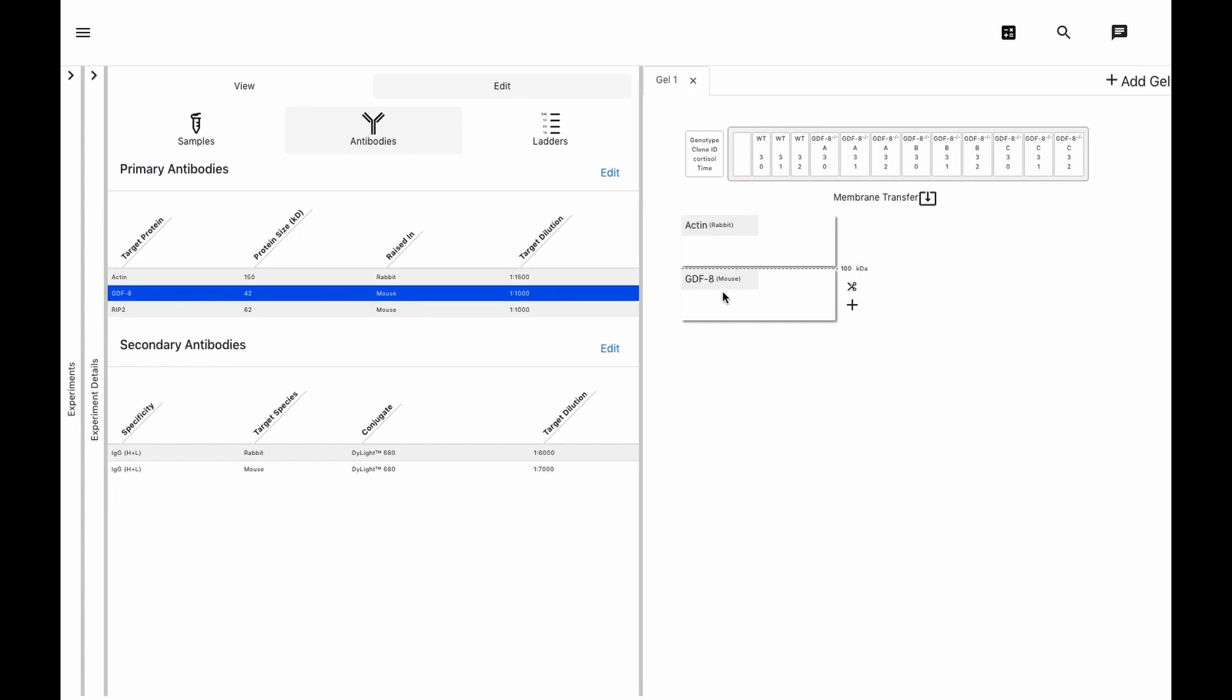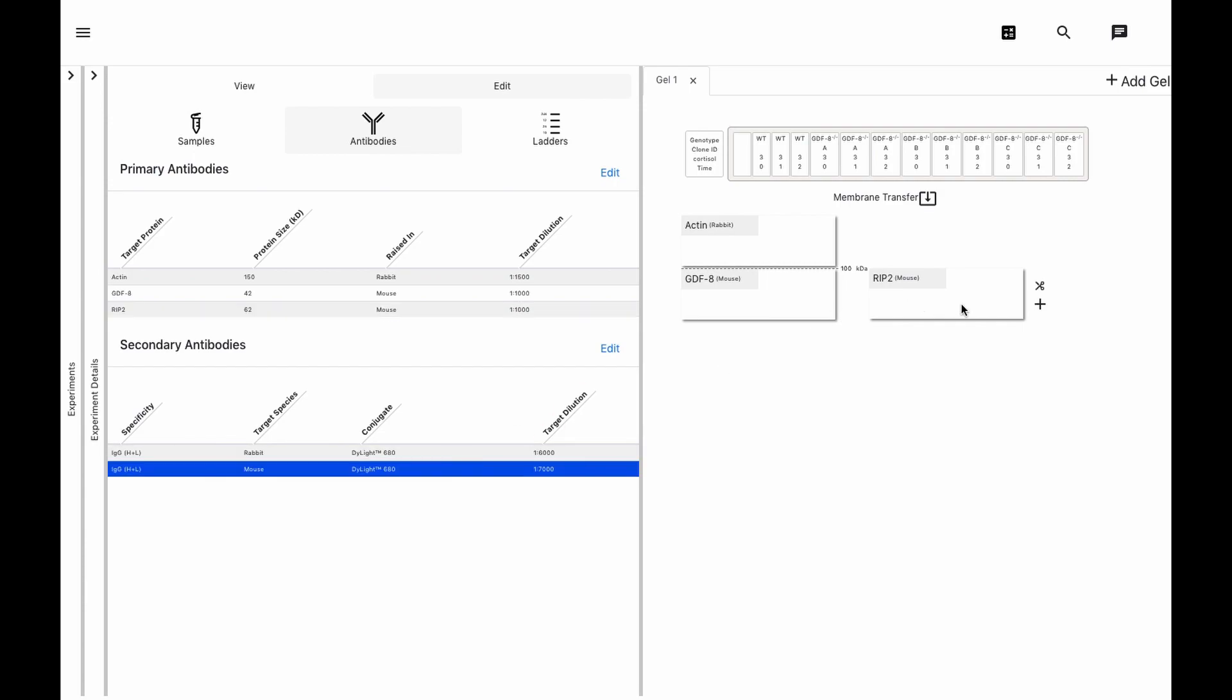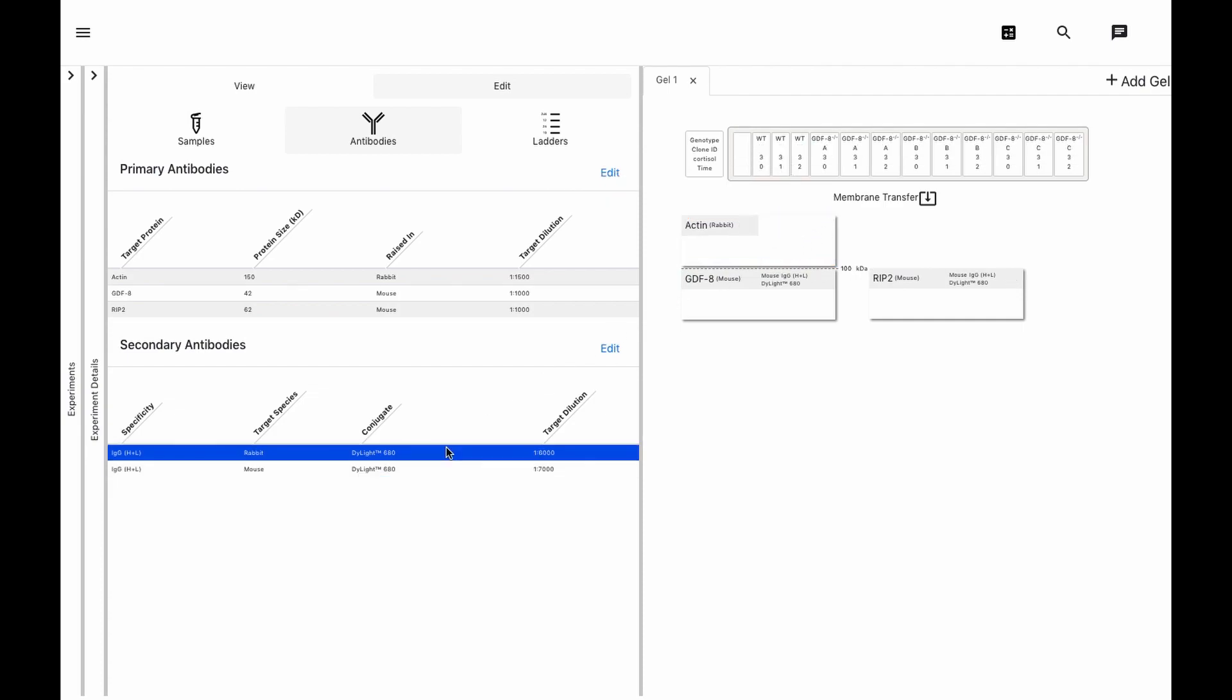And we will strip and re-probe to detect RIP2 levels. Now we just need our secondaries. Notice that the software catches errors such as primary-secondary specificity mismatch. We can fix this by ensuring the secondary antibody is specific for the primary antibody specified.